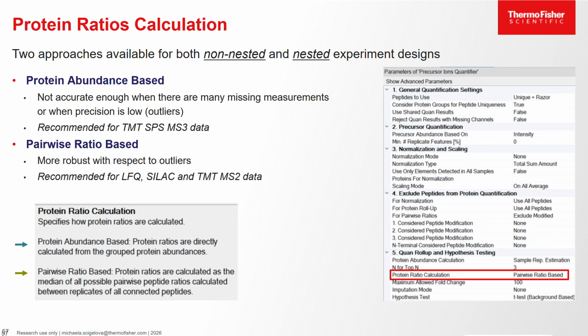What we have here is the two methods, which obviously is great. You have choice. But on the other hand, it's again one of those questions which arise: which method to use, which one is better for my experiment. And I hope that after some discussion here, you will be able to choose the correct one.